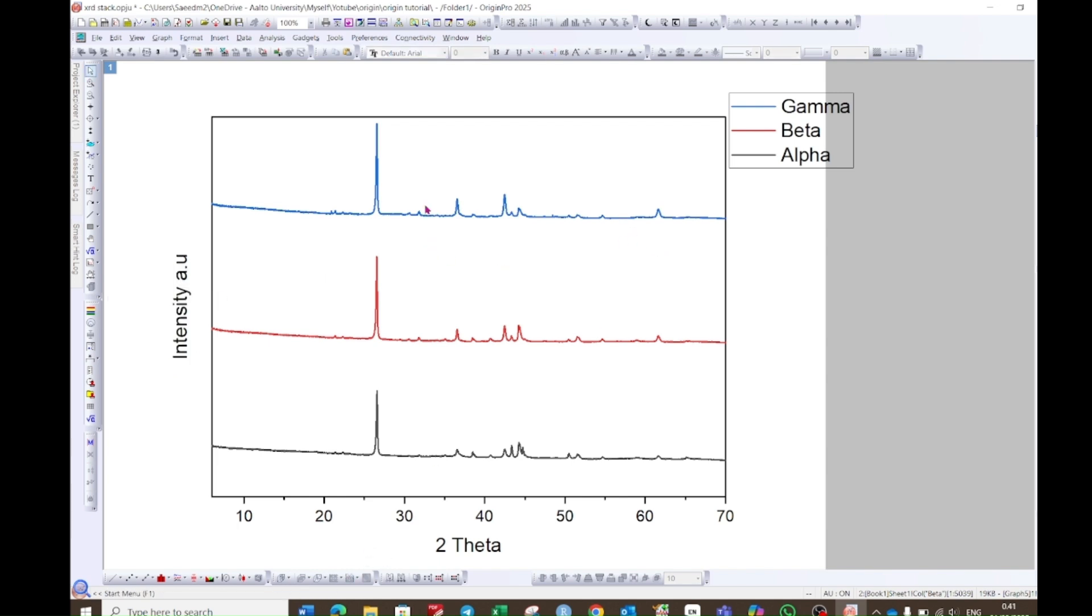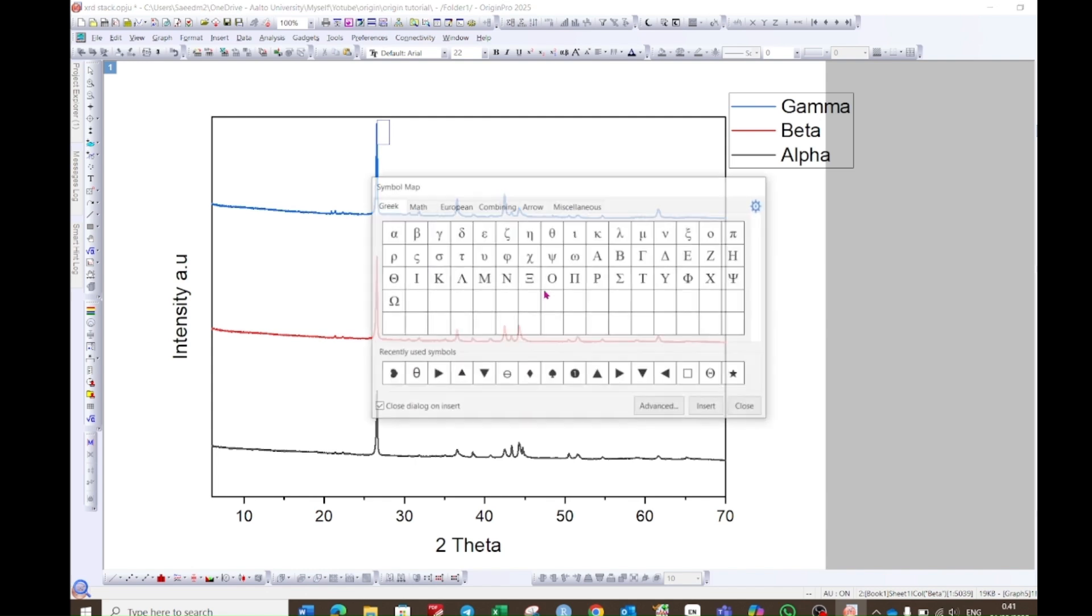Now if we have to give different symbols to different peaks, choose this text option from this toolbar. Make a single click and then right-click in this box. Go to insert and then symbol map. A window will pop up.